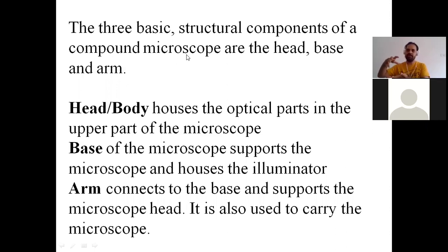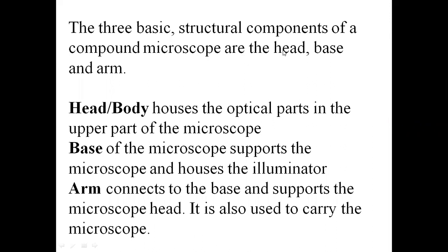It is a care for the instrument. So whenever you are handling such an instrument, make sure that one hand is at the base of the microscope and one hand is holding the middle portion, the carrying portion. So that was about your small care thing.